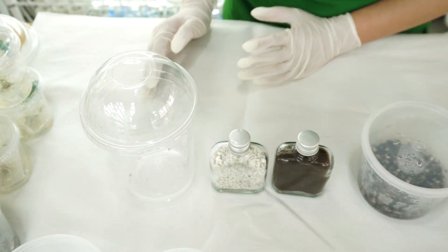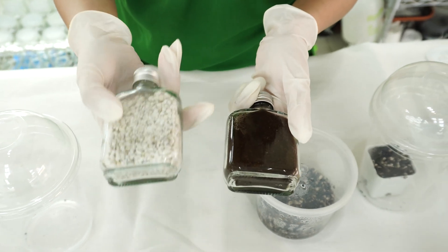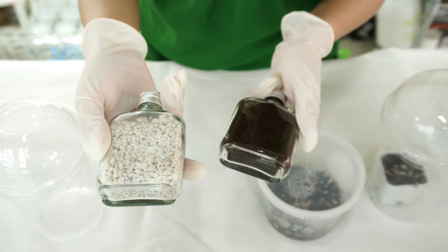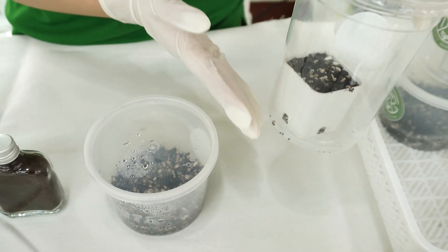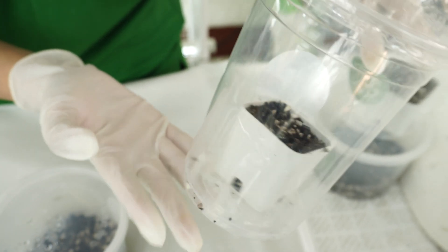We also have a dome plastic container, perlite, and peat moss — and this is how it's going to look after we mix them together. We use 50% peat moss and 50% perlite. This is also the container we use, and there is a little pot inside our dome container.